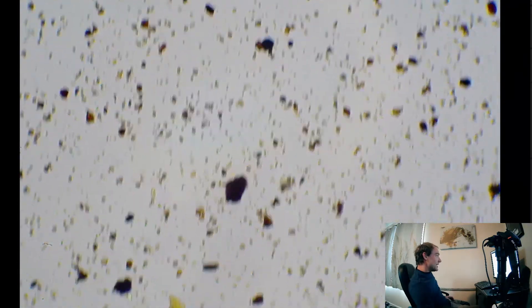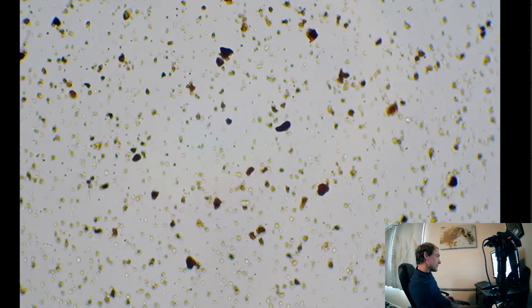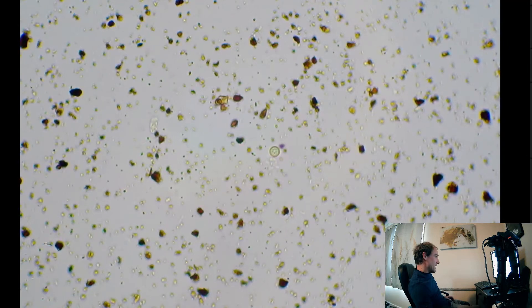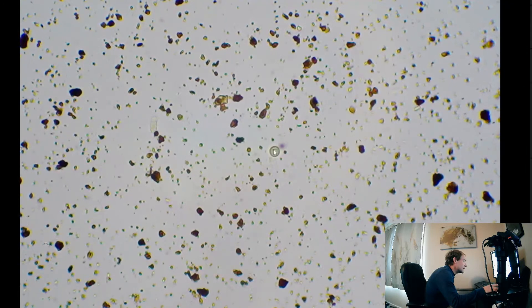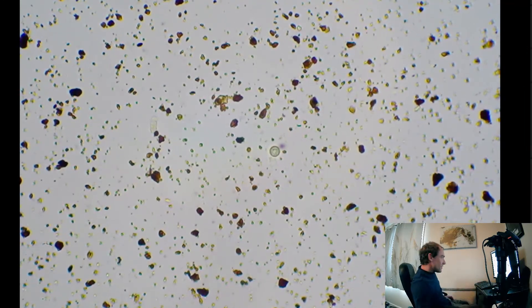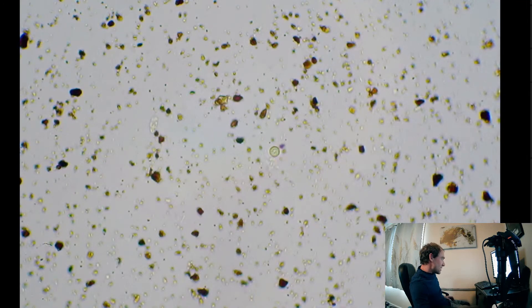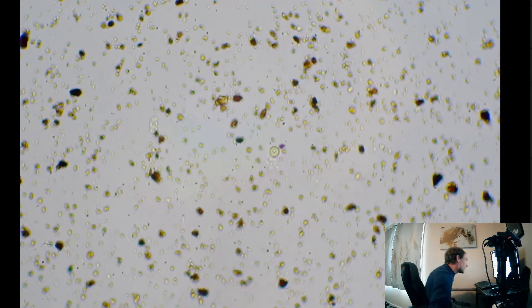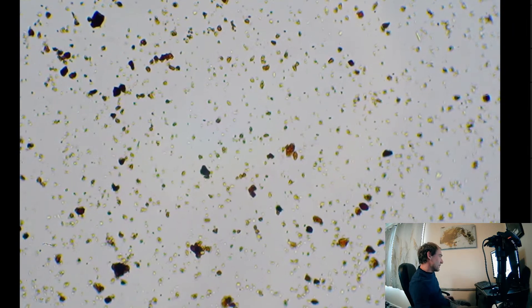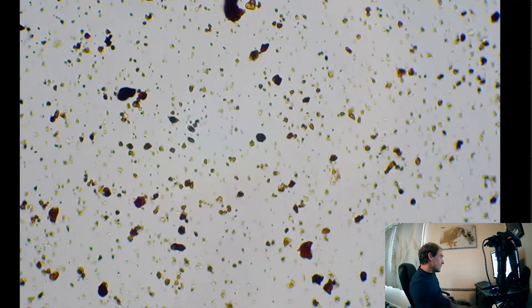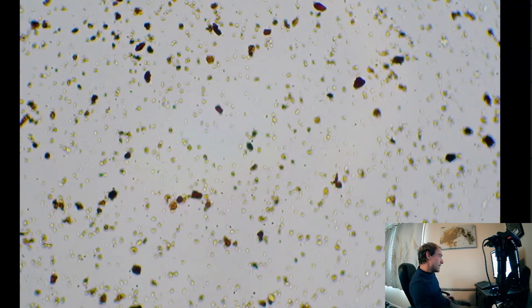Wonder if there's anything else that might surprise us in here. Really surprised if we found a nematode or something. We got a little round something or other right there. It could be a cyst or some type of spore. Can't quite make it out. But here, might as well, since everything's really small. We're at 400x right now. All right, have a great weekend Vince.